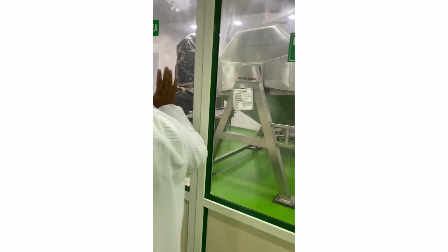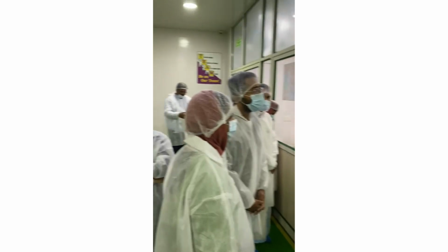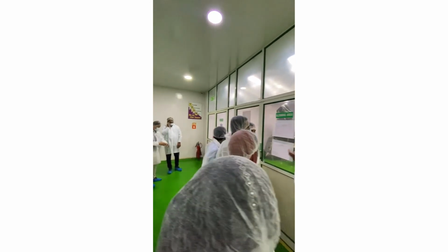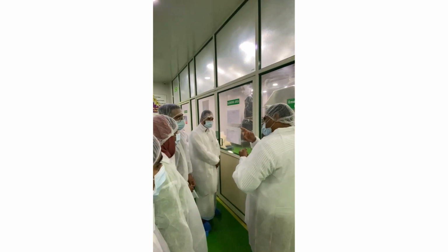This is the coffee section: coffee creamer, iced coffee creamer and iced coffee black. Here we have an octagonal blender. It will rotate in the U direction. The ingredients we have are iced coffee creamer and black. We follow the same process as before: analyzing, approval, documentation, dispensing.